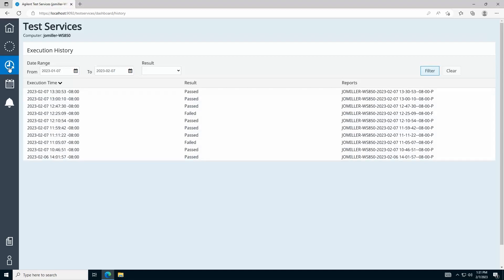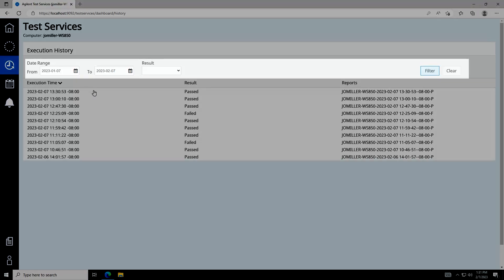By default, the Execution History page shows you results from all tests that were run in the past month, but you can filter these results using the fields provided above the list.